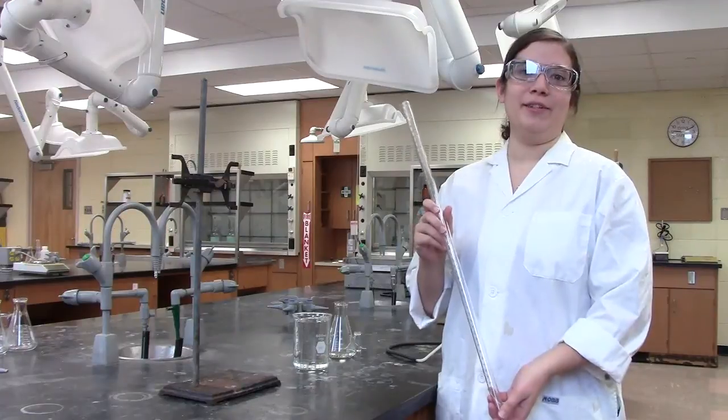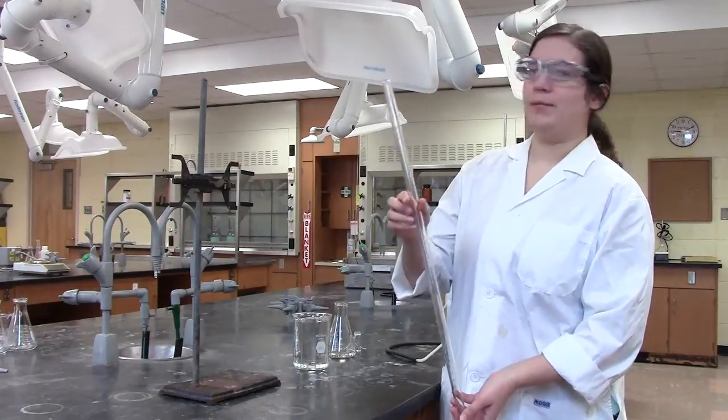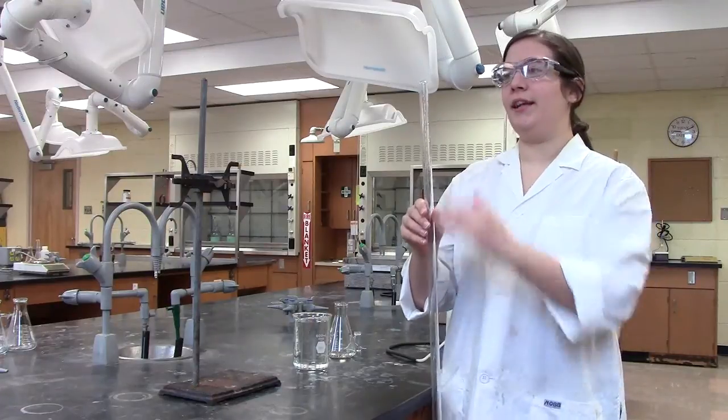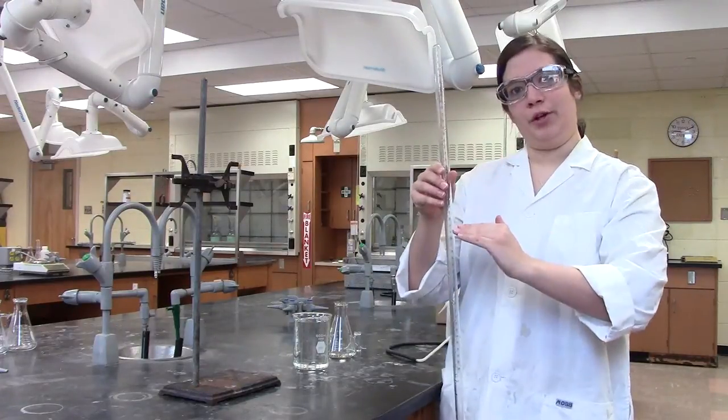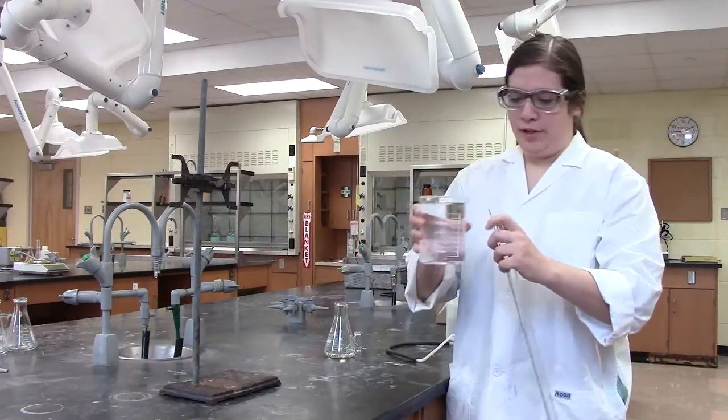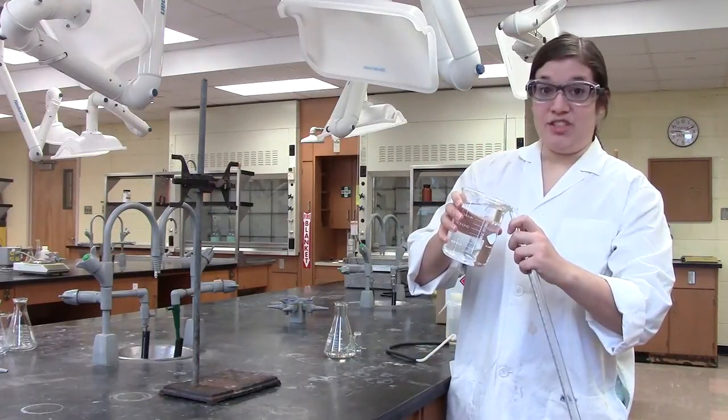Using a gas buret to measure gas volume by water displacement, it's important to note that you can only read the gas buret to one decimal place, and that the zero's at the top, and you read the volume moving down.